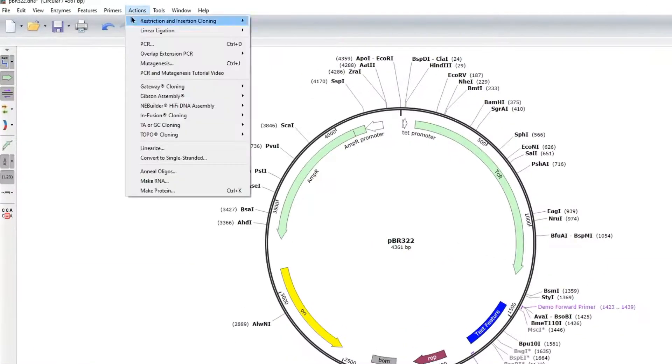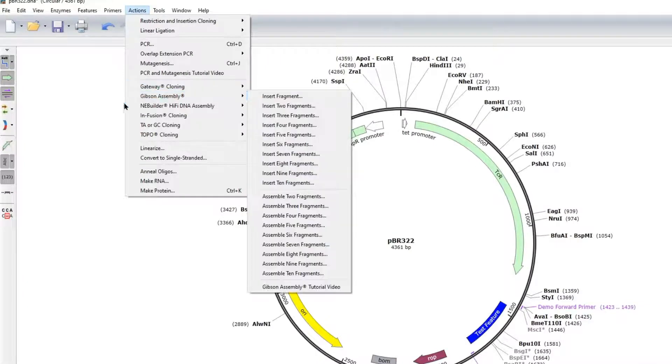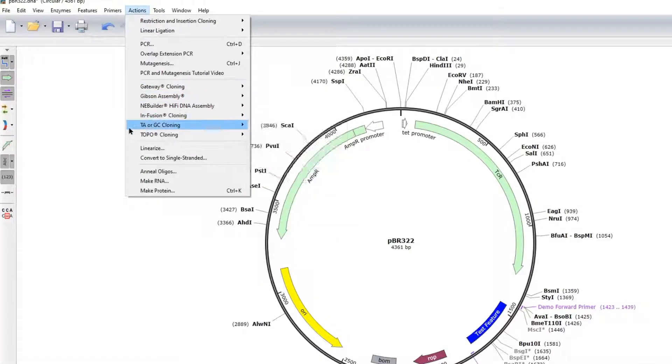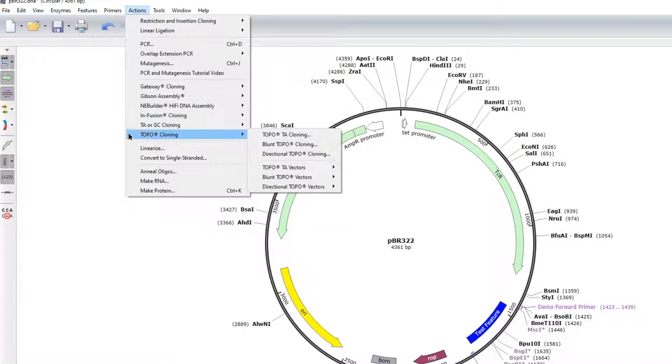SnapGene can also automatically design primers for specific techniques via the Actions menu.